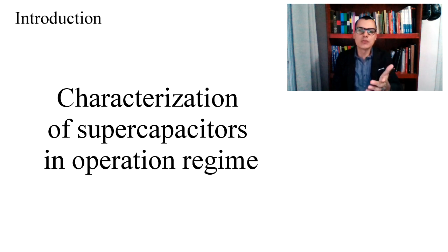Some examples of these applications are ion insertion, ion intercalation, and ion deintercalation studies in carbon-based materials, as well as to verify doping and de-doping effects. In the case of ionic intercalation, this phenomenon is indicated by the G-band separation in two peaks.